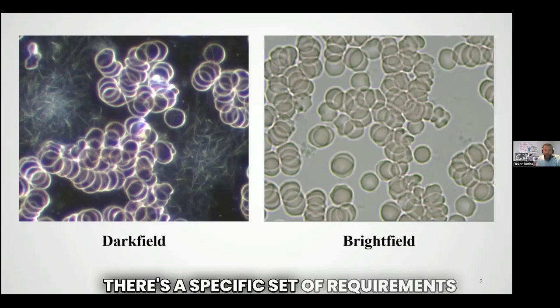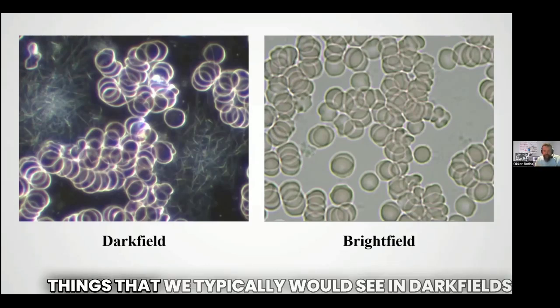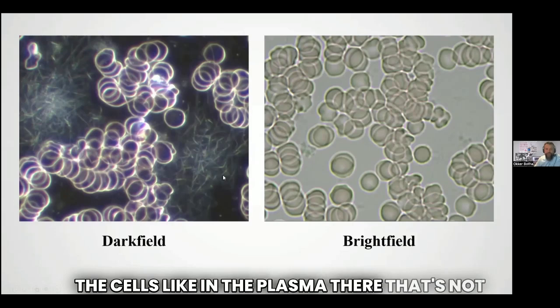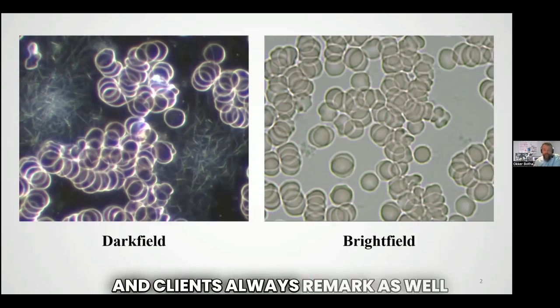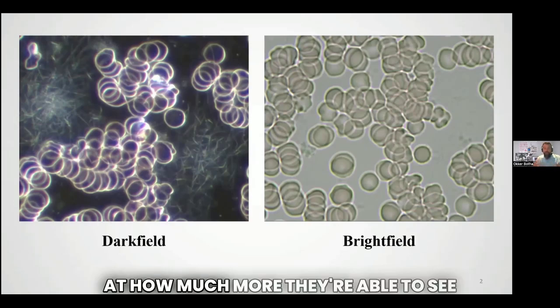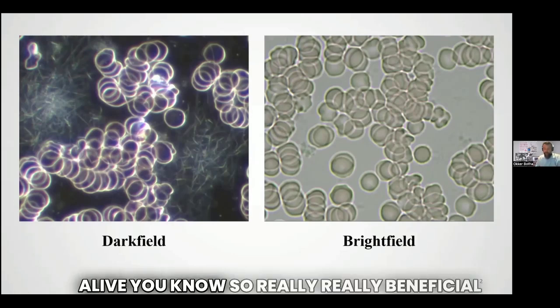There's a specific set of requirements in a dark field microscope to allow us to see all the things that we typically would see in dark field. And you can see there's so much visible between the cells, like in the plasma there, that's not visible at all in the bright field image. It's always very interesting to see, and clients always remark as well, when we go from bright field to dark field, they're always amazed at how much more they're able to see. It's almost as if the sample has come alive, so really, really beneficial.